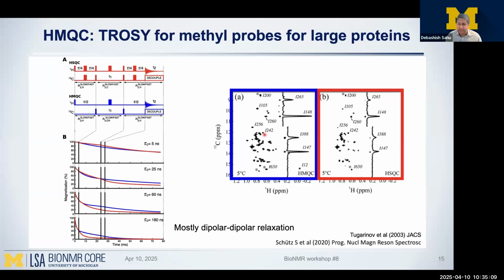Setting this up is exactly the same. You just type in so fast and you just set it up. I'll show you how to do that. But it's not anything different. So anytime I say methyl TROSY, this is what I'm looking at. Okay, this blue spectrum.